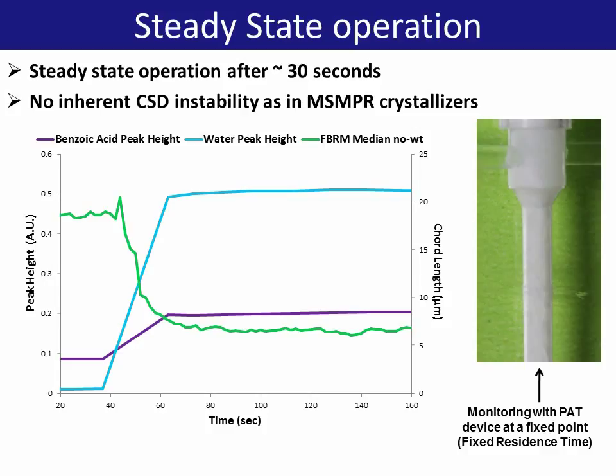Initially, the instruments read background noise and spectra for IMS, which is used to clean and prime the system between runs. The time to displace the IMS is the limiting factor in reaching steady state, but in spite of this, it is achieved in approximately 30 seconds.